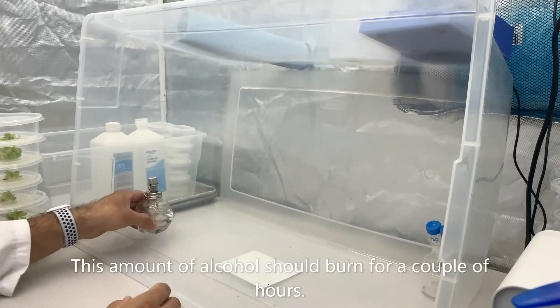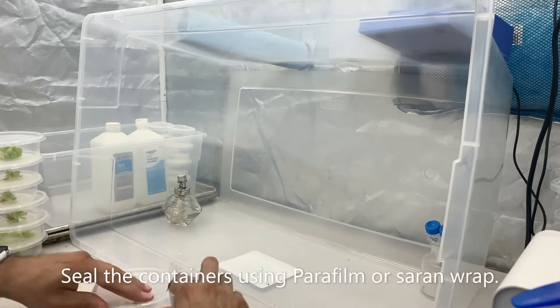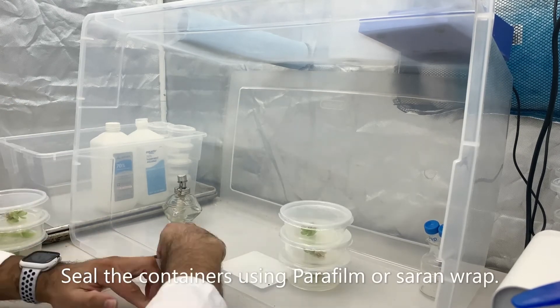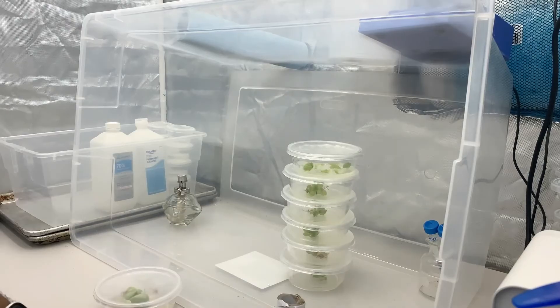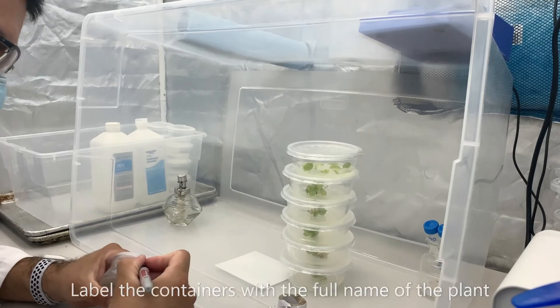This amount of alcohol should burn for a couple of hours, so you should be good for a couple of tries. Seal the containers using parafilm or saran wrap. Label your containers with the full name of the plant and the date.